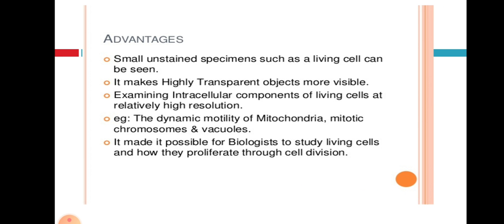It allows examining intracellular components of living cells at relatively high resolution. For example, the dynamic motility of the mitochondria, mitotic chromosomes, and vacuoles can be observed using phase contrast microscope. It made it possible for biologists to study living cells and how they proliferate through cell division.